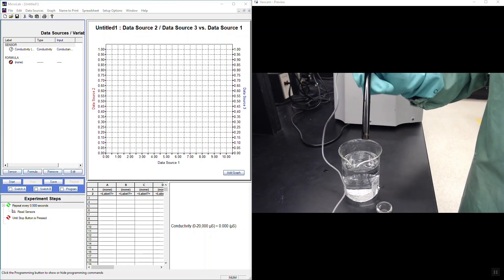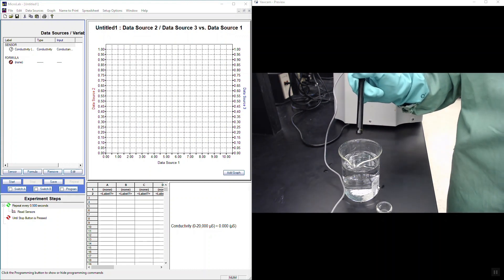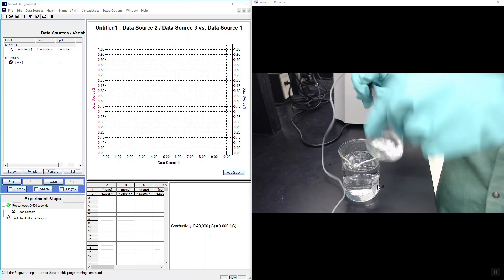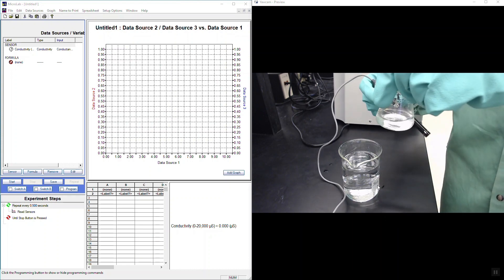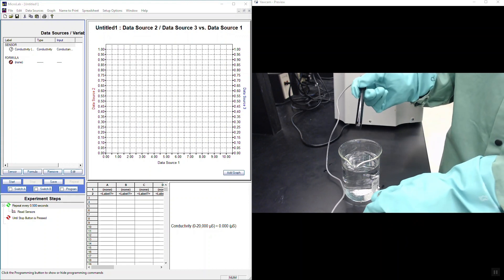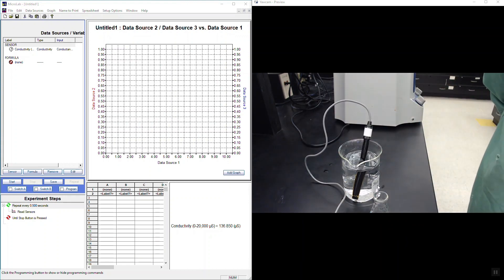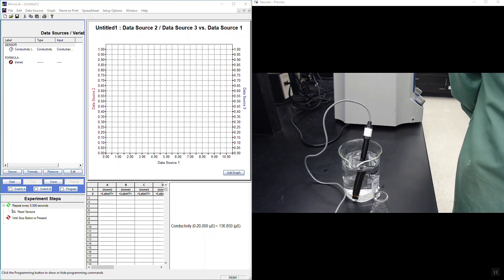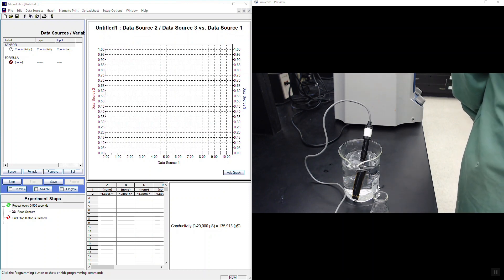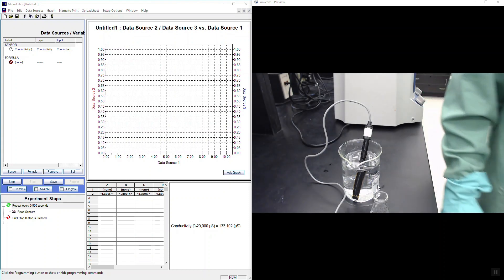Record conductivities for all solutions. For your 1.2% stock solution in the 125 mL flask, there may not be enough liquid at the bottom to submerge the probe — if so, transfer it to a smaller flask first. The reading does jump around, so just pick your best reading after it has stabilized for 30 seconds to a minute.